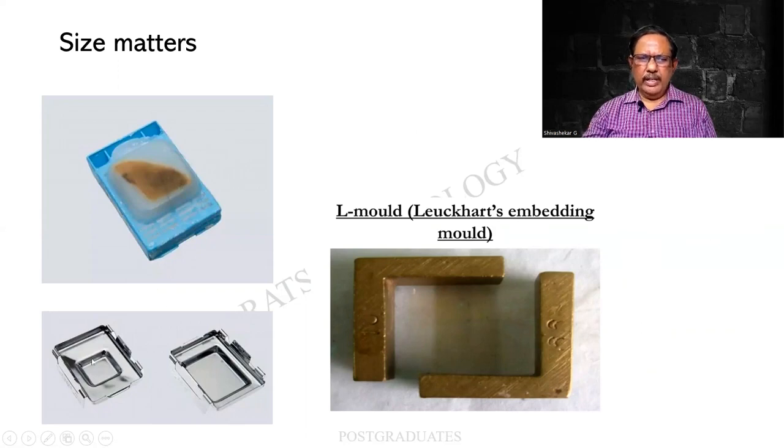So this will have to change according to the size of the tissue. For example, this is a large tissue. I should not compress it into a small kind of wax, so that I find that there will be a kind of folding and so on.